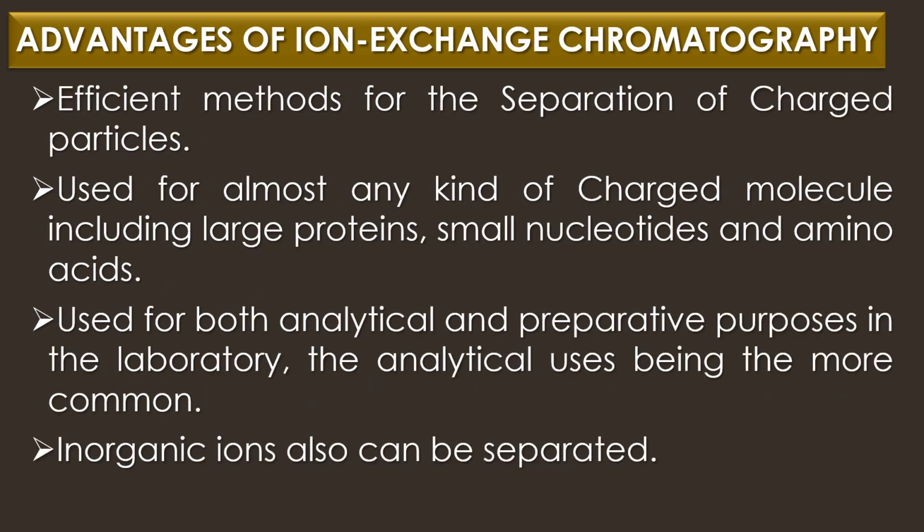Advantages of ion exchange chromatography. Ion exchange chromatography is one of the most efficient methods for the separation of charged particles. Ion exchange chromatography can be used for almost any kind of charged molecules, including large proteins, small nucleotides, and amino acids. Ion exchange chromatography is used for both analytical and preparative purpose in the laboratory, the analytical uses being the more common. Inorganic ions also can be separated by ion exchange chromatography.